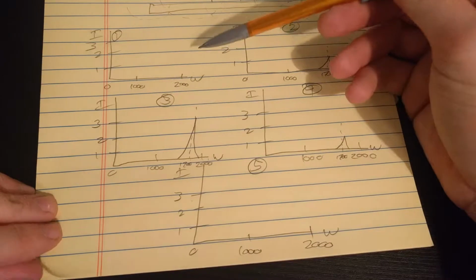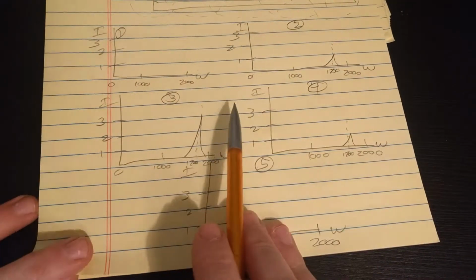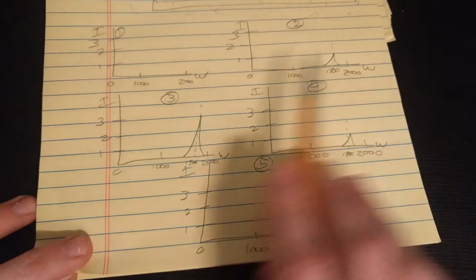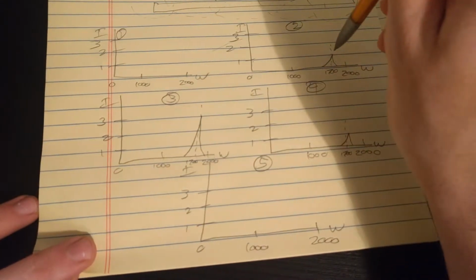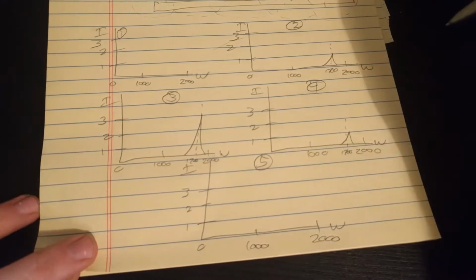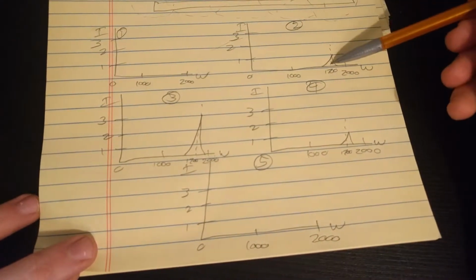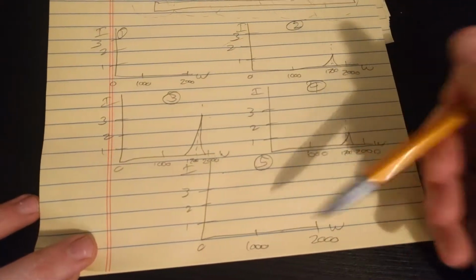So we can take the information in these 5 different spectra, and from each spectrum we're going to collect 1 bit of information, and that bit of information is going to be the peak intensity at 1700 wave numbers. So for spectrum 1 it's 0, for spectrum 2 it's 1, for spectrum 3 it's 3, for spectrum 4 it's 1, for spectrum 5 it's 0.